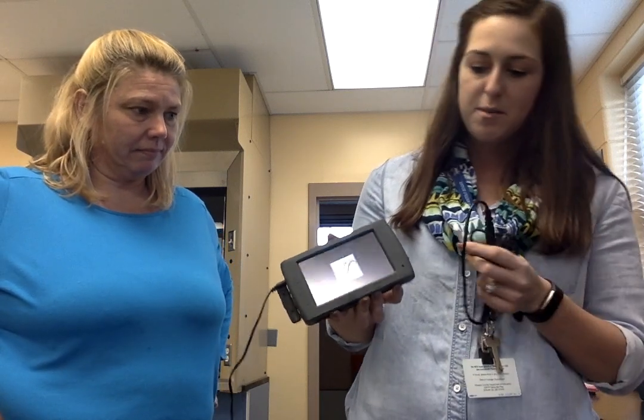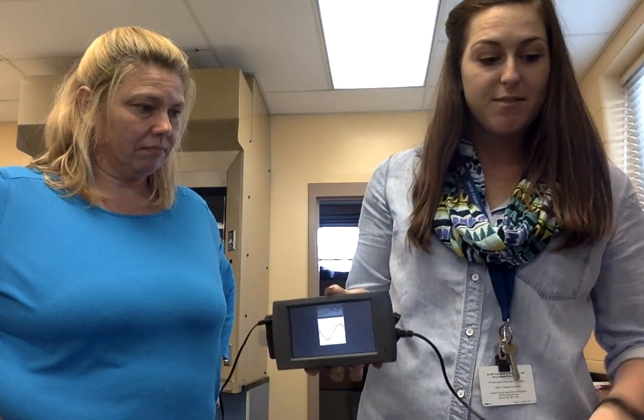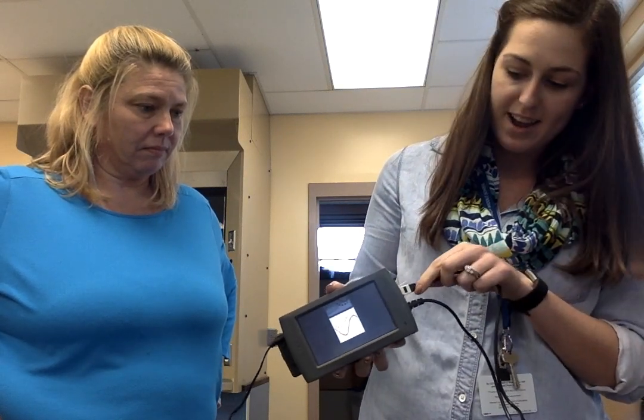When you're ready to start the lab, you'll find two temperature sensors plugged into the side of your Vernier monitor. The sensors will already be plugged in for you when you arrive at your lab bench.